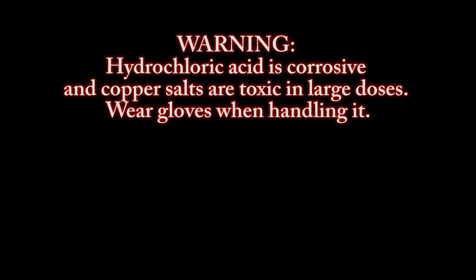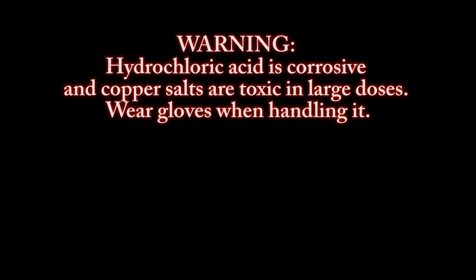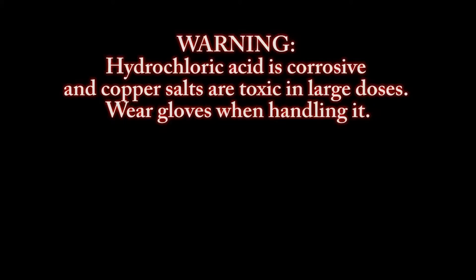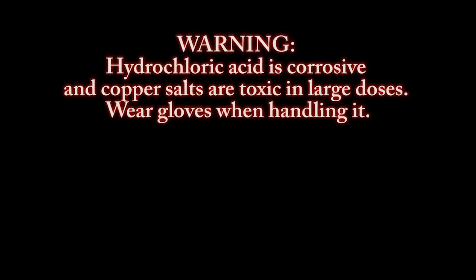Before we get started with the practical, I want to give a warning that hydrochloric acid is very corrosive. If you look on a container of hydrochloric acid, they have written these warning labels. Also copper salts are toxic in large doses, so make sure you wear gloves when you're handling it.